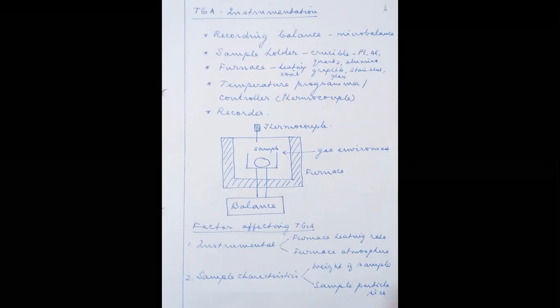And the furnace, we are using heating coils. Normally heating coils are used. Electrically, the substances are heated.